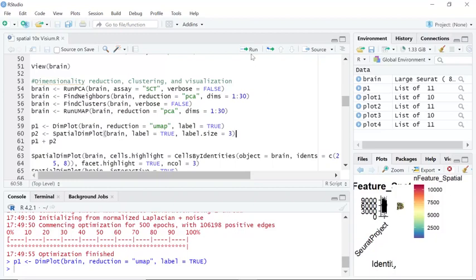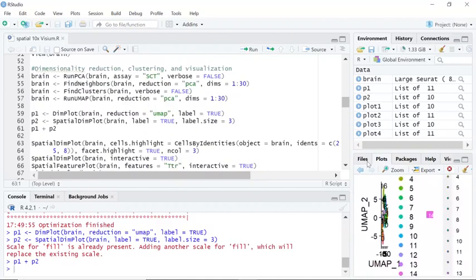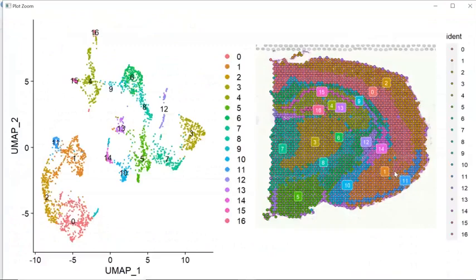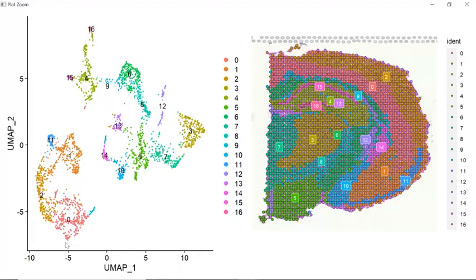Let's also run the SpatialDimPlot function. Now we can visualize the spots clusters and the spots position on the image. We can zoom in. You can see the spots clusters on the left hand side.